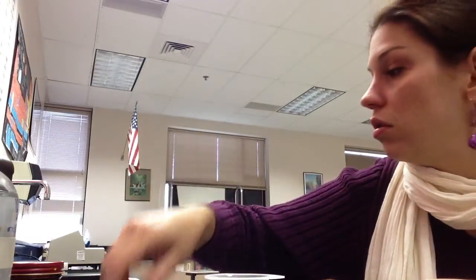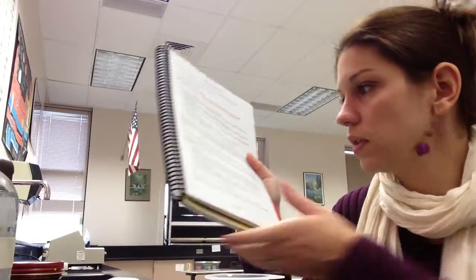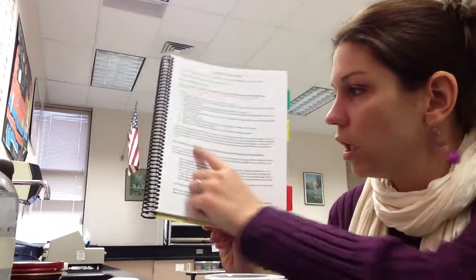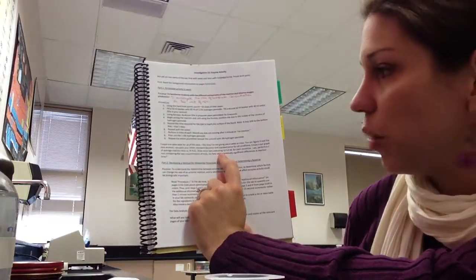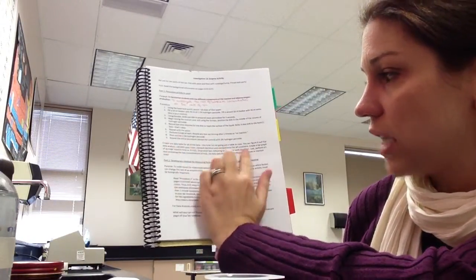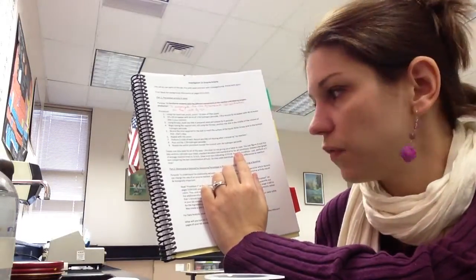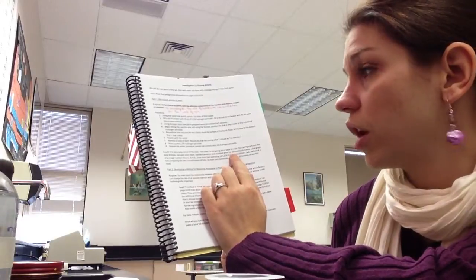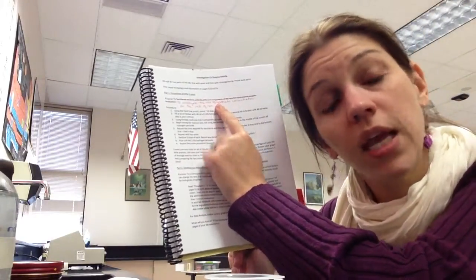And so you did not get a data table in your lab notebook this time, because I want you to design one yourself. It needs to be neat, it needs to be organized, it needs to have all the necessary parts. You're going to remember down here that it tells you what your data analysis is going to be, so don't be confused about that. So you're going to do the data analysis as indicated. There's a lot of number crunching with this first part, and then you're going to write me one conclusion statement about the role of substrate concentration. And that's it for part 1.